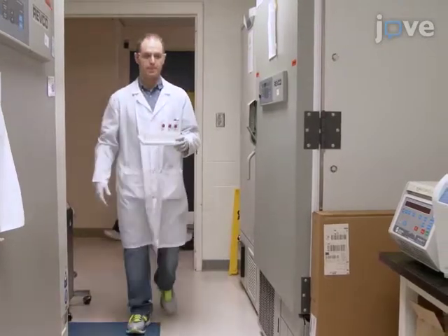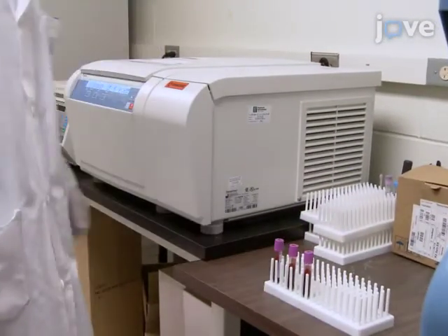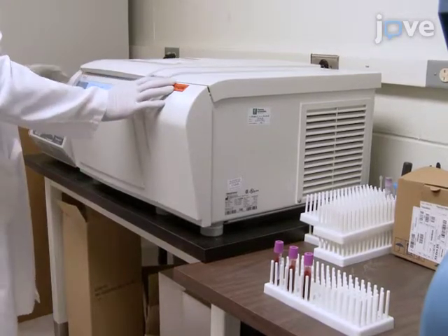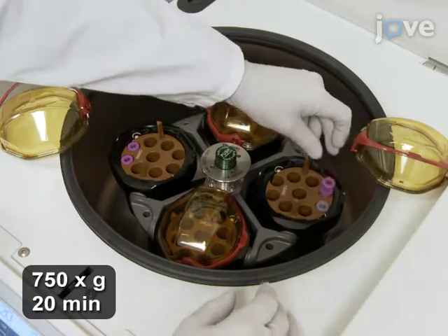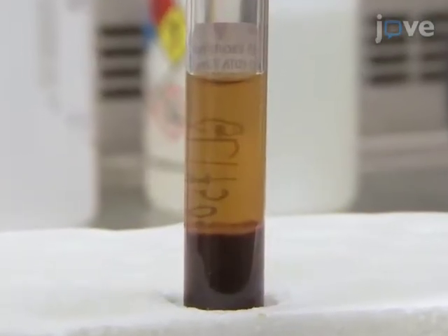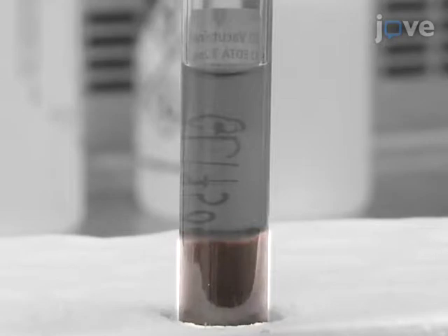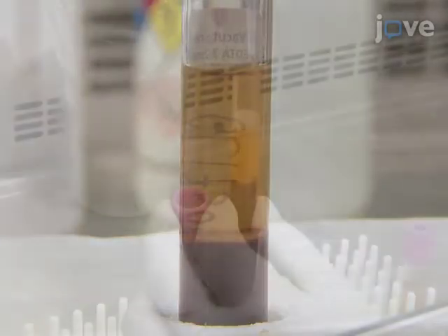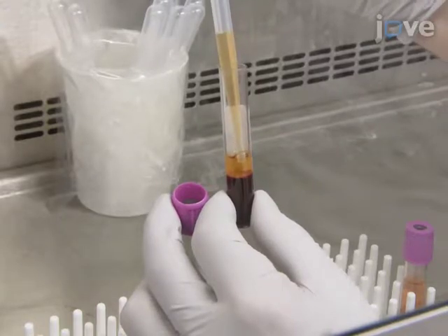In this procedure, human blood samples are collected in 3 4 milliliter EDTA K2 tubes to provide a total volume of about 12 milliliters. Centrifuge the blood samples at 750 times gravity for 20 minutes. This will fraction each sample into an upper phase of plasma, a thin middle phase of leukocytes, and a bottom phase of erythrocytes. Pipette the plasma off of the top of the blood sample using a disposable transfer pipette.